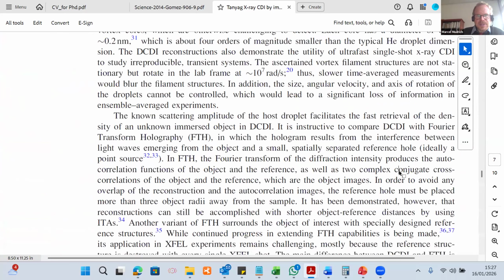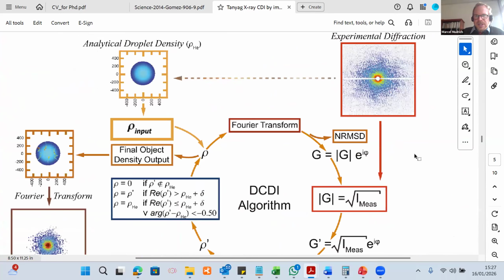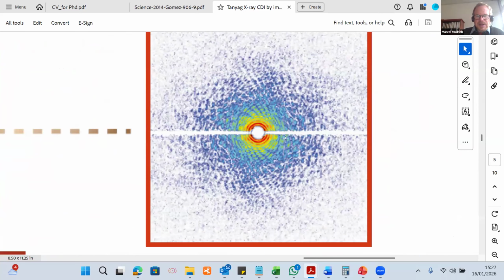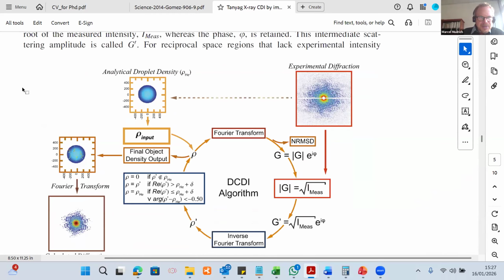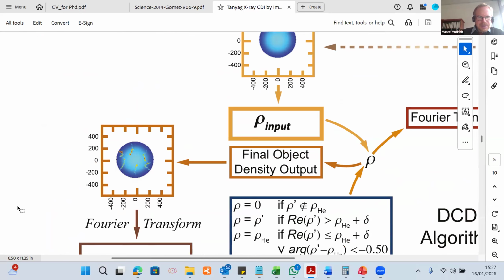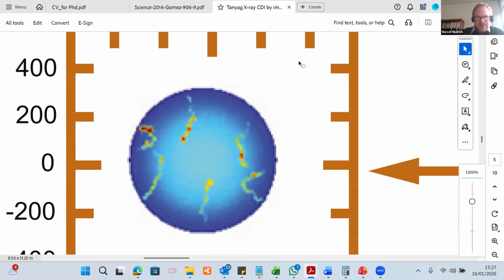No, but yeah, this is quite impressive that it's possible. From scattering images like this one, where you would think it's a complete mess and hard to extract any useful information, by doing these clever phase retrieval algorithms, and in this case using the input information that assumes a spherical helium droplet as the framework around these vortex lines, this helped to reconstruct the structure of these vortex lines inside the droplets.